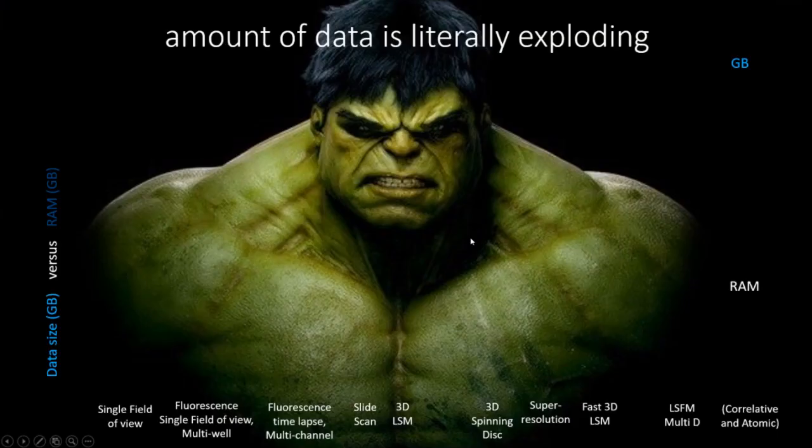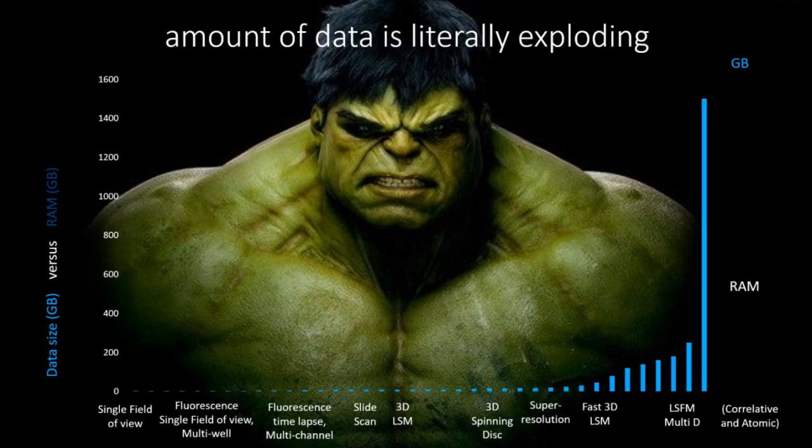So nowadays, as I already mentioned, these imaging instruments are producing ever more data, more resolution, more time, not only in X, Y, and Z, but also in time. And so the amount of data is really exploding. And so what does it mean? It means the size of the data sets are bigger than the size of the computer.